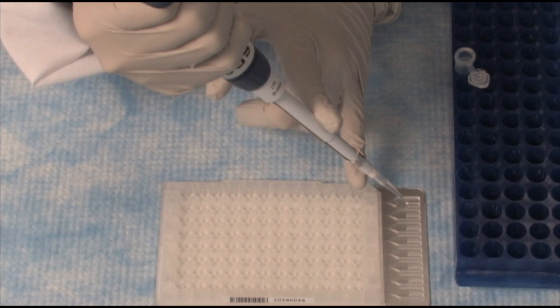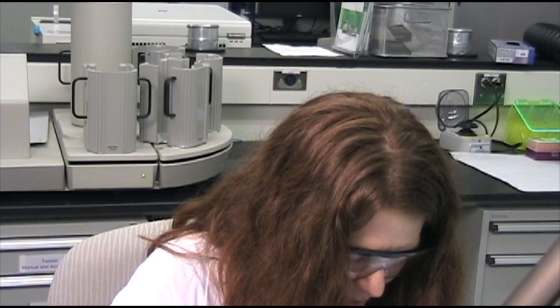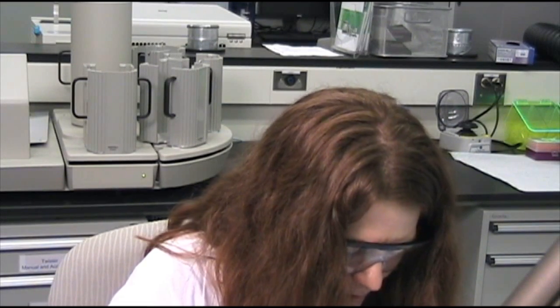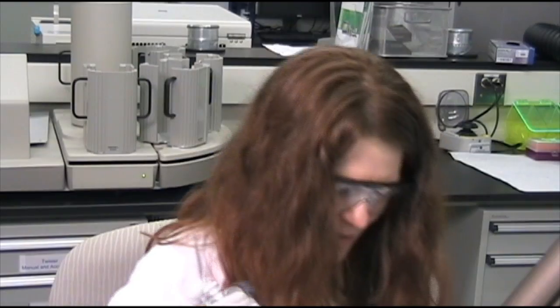Done. Now I'll go into the next fill port, which is for number two, add in the Pipetman, and pipette my sample. Done — it's as easy as that. And there we go, all eight ports are filled and we're ready to take it to the next step.